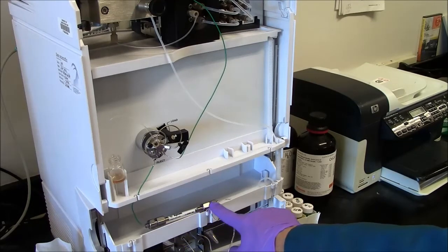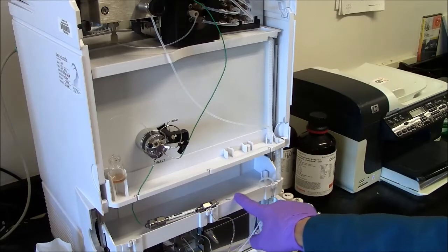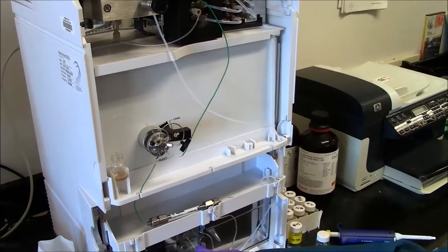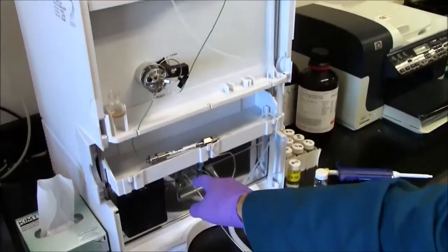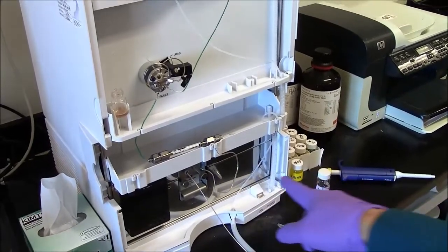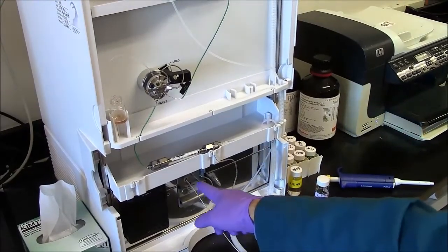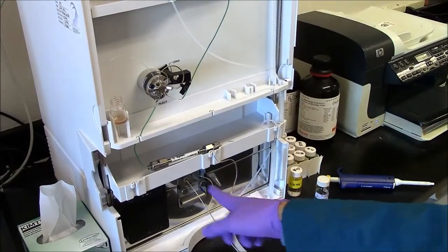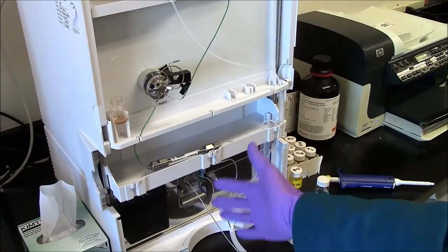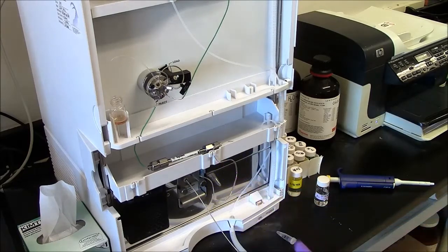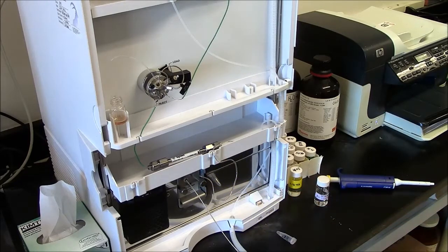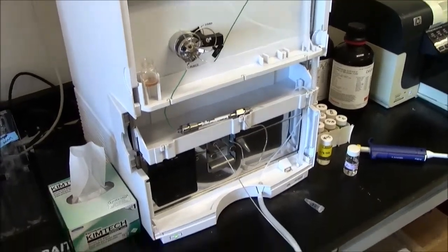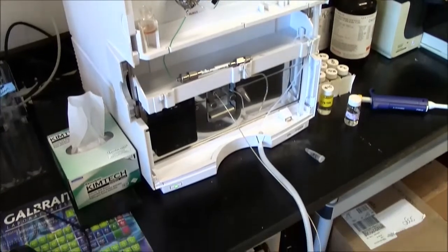After they come out of the column, they go into a UV detector down here. After being measured by the UV detector, they go into the waste jar on the floor.